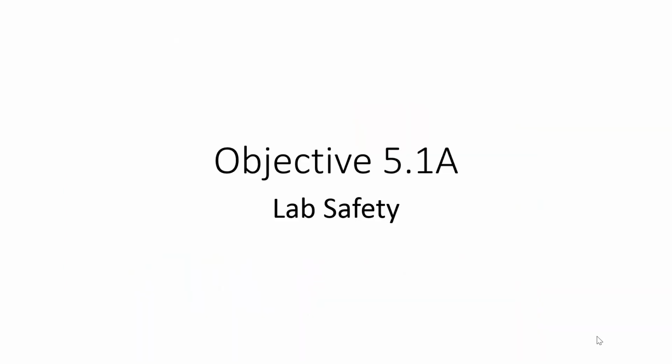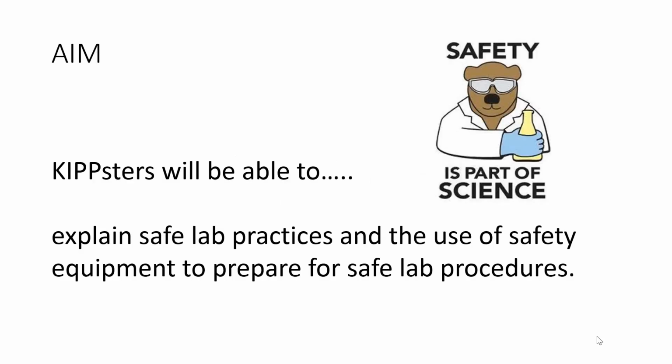Today we're going to be learning about Objective 5.1a, which deals with lab safety. It's extremely important because when we do labs and experiments in class, we'll need to make sure we're being safe and making sure that no one has the chance of getting injured.